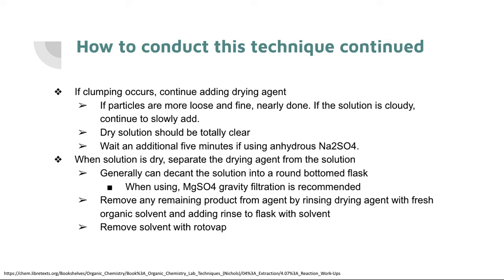That is, pour the solvent and the desired product into a round bottom flask, leaving the anhydrous agent behind. Or, because MgSO4 is such a fine powder, the solutions must be filtered. Since we're back to it, some of the downsides are that MgSO4 is so fine that it needs to be filtered. Plus, it does tend to absorb product.